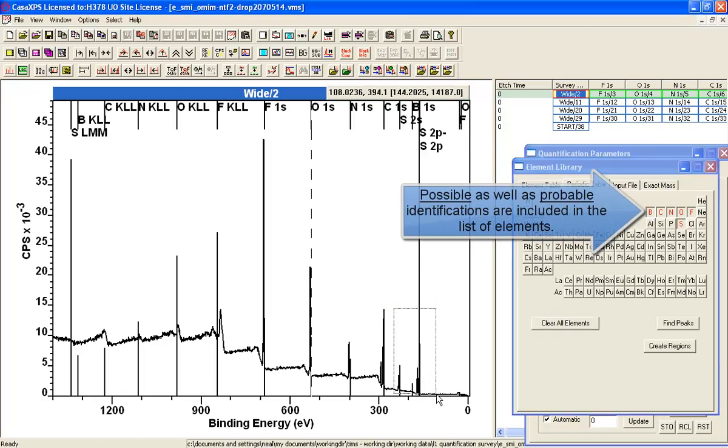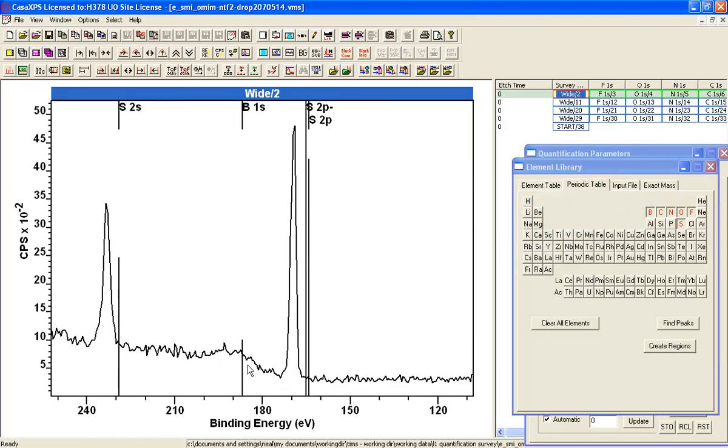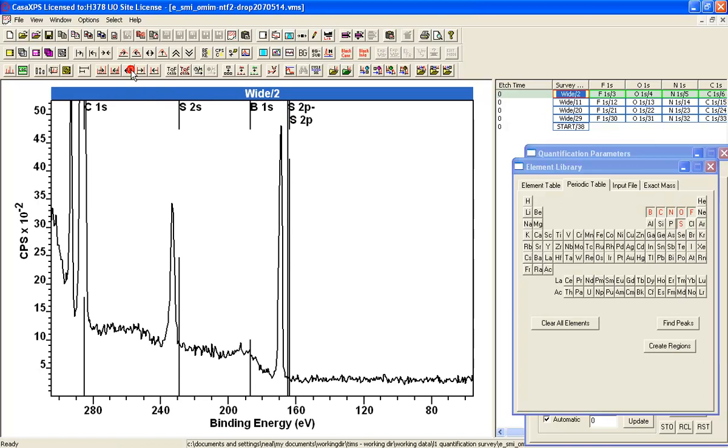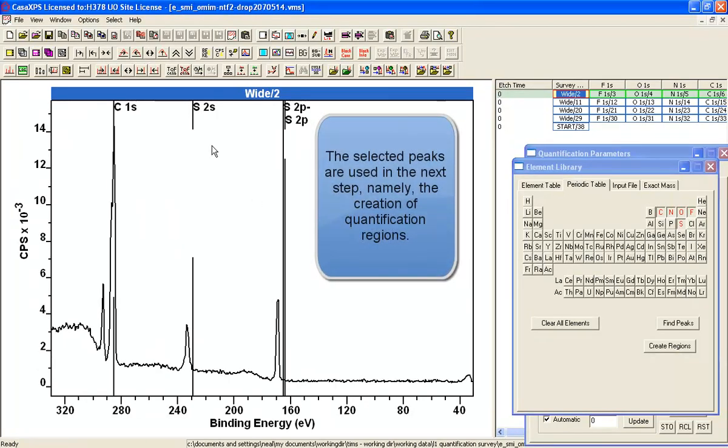I don't believe there's any Boron in this sample. And if I look at the data, the structure that has been identified as Boron is probably a loss peak associated with this S2P. And so we'll deselect that. And we'll just check that the other peaks make sense.